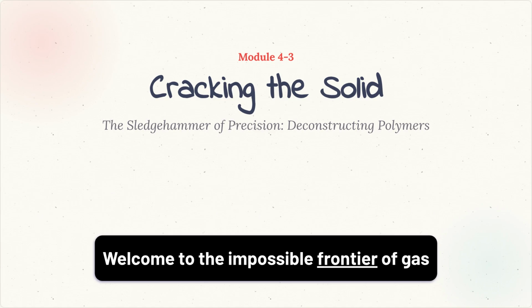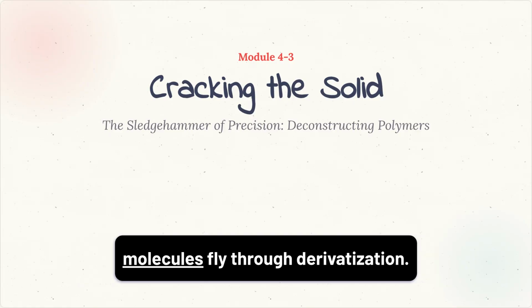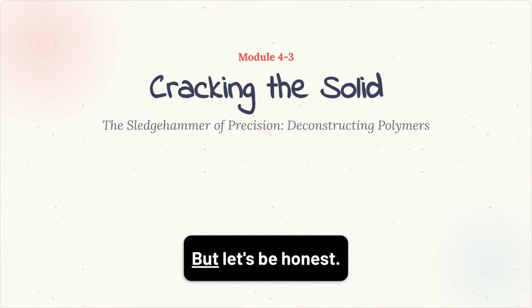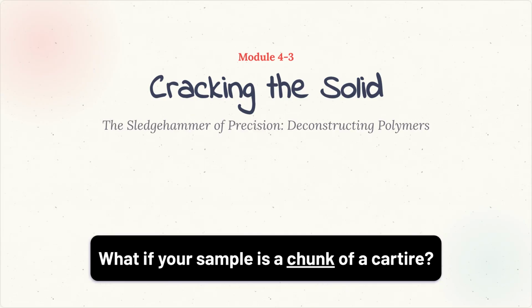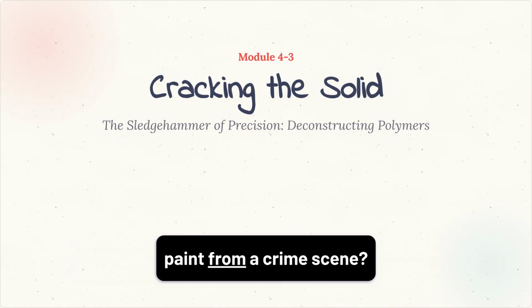Welcome to the impossible frontier of gas chromatography. In our previous units, we learned how to make molecules fly through derivatization. We mastered the oven and the column. But let's be honest, what if your sample is a chunk of a car tire? A high-performance polymer? Or a single flake of paint from a crime scene?